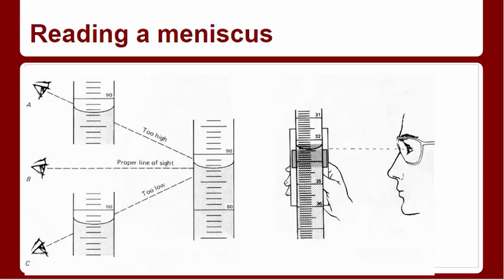And this person is also putting a card behind it. Sometimes I like to take a marker and draw a straight line with a ruler and put that up behind. Sometimes that helps me. I've got kind of old eyes now, so yes, it helps me see it a little bit better. Well, even with young eyes, you still need some help sometimes.